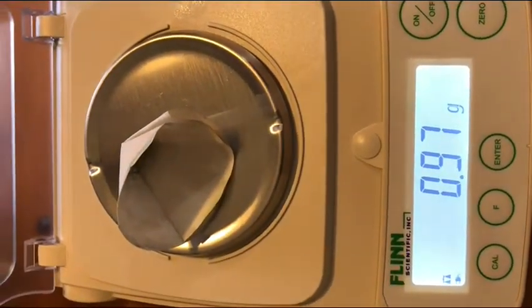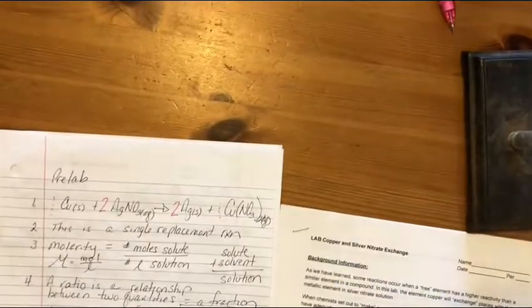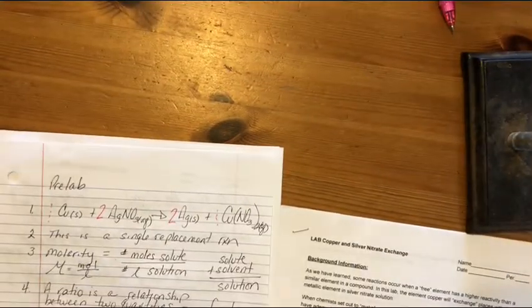Looks like 0.97. So one of the things I forgot to do is measure the mass of the filter paper last time. So hopefully this will all make sense.